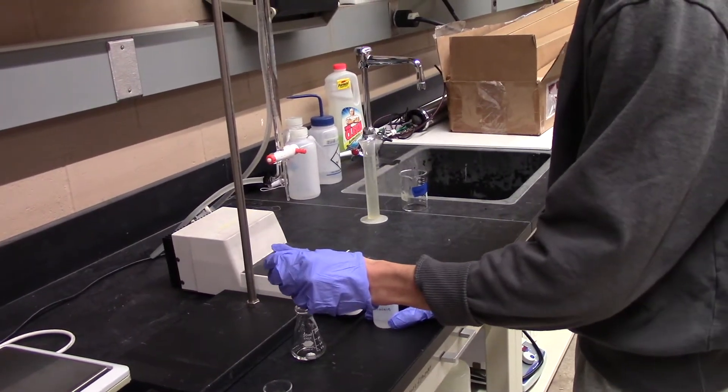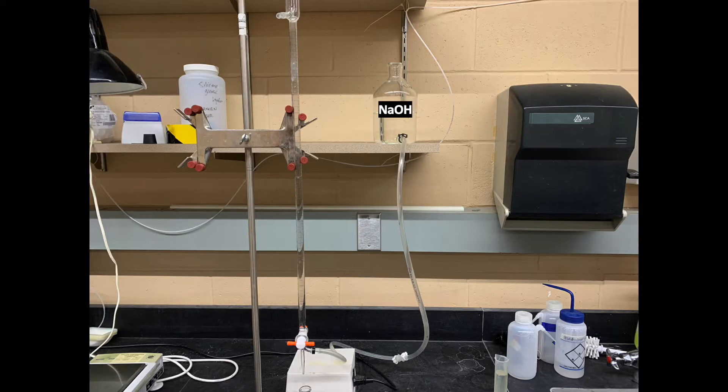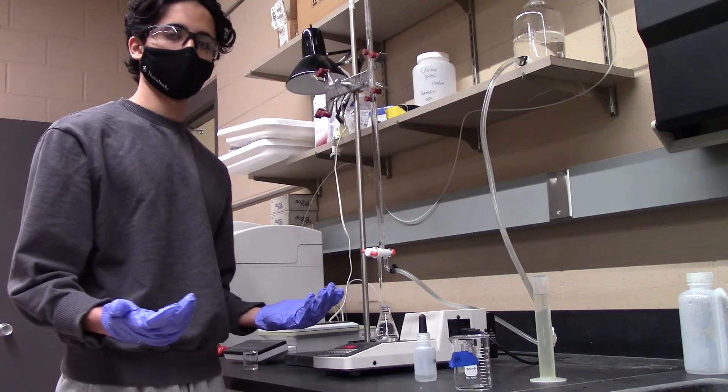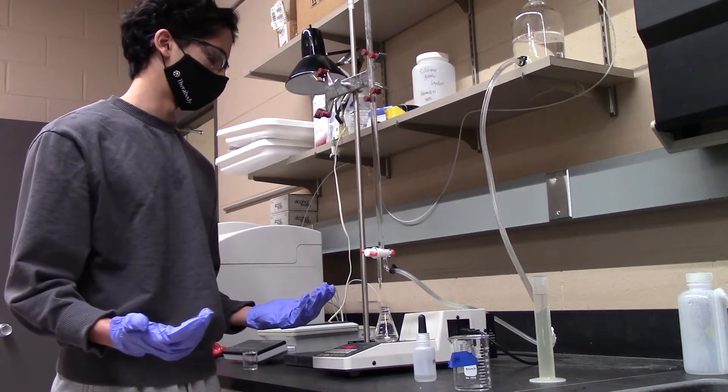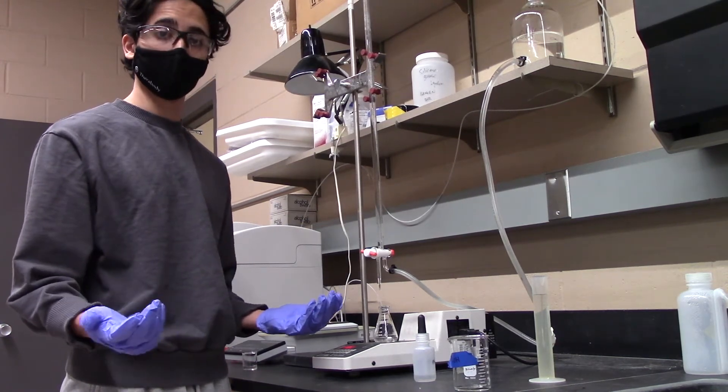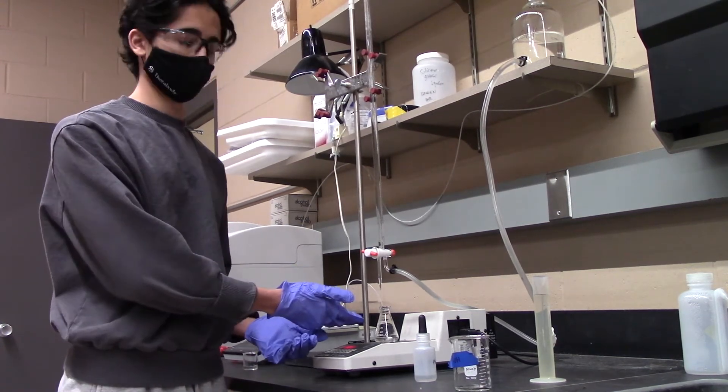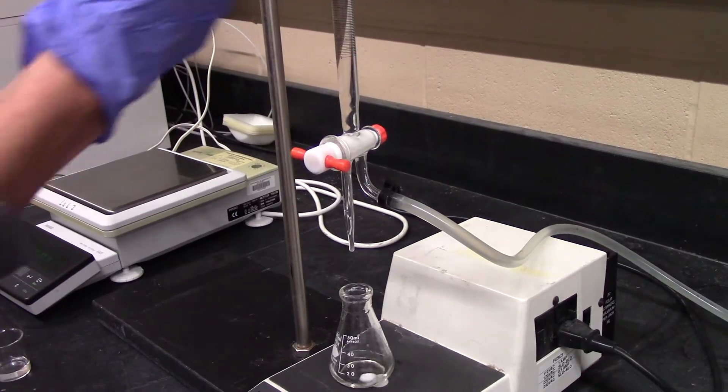Then add a drop of phenolphthalein indicator. The titration system should be set up as such. Once everything is set in place, it is time to titrate until you see a clear color change within your solution.